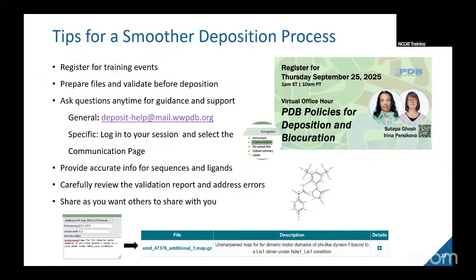Directly, you couldn't access it through the PDB. Yeah, we operate under strict confidentiality. So we recommend people do this kind of thing, sharing it themselves. In that case, we don't have to upstream, but we can just modify, if there's a recommendation from review, we could modify the structure and then deposit, right? Yeah, you could think about that when you deposit.